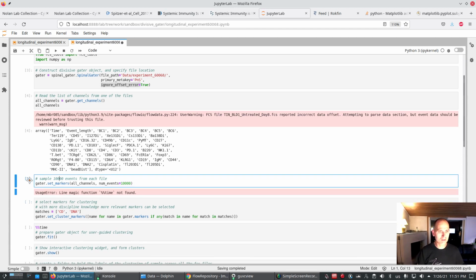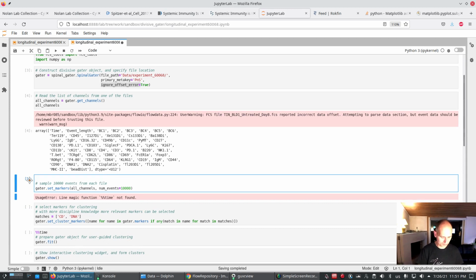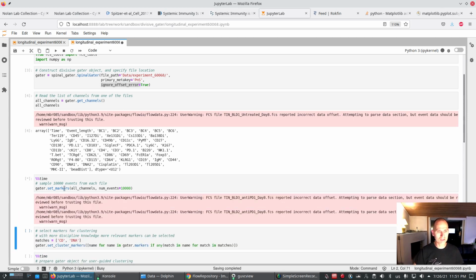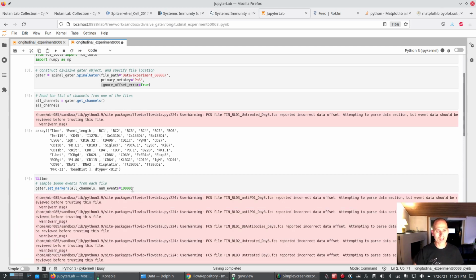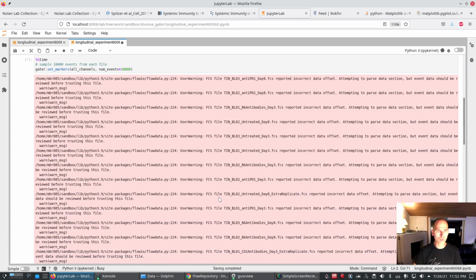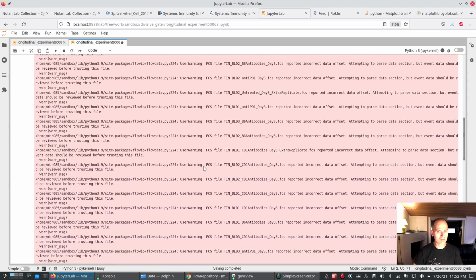I have a magic timing command here, just to let you see how long it takes to load these FCS files. What I'm doing now is taking a sample of 10,000 events from each of the FCS files that I downloaded. There are some error warnings here, and that's because there are some errors in the FCS files.